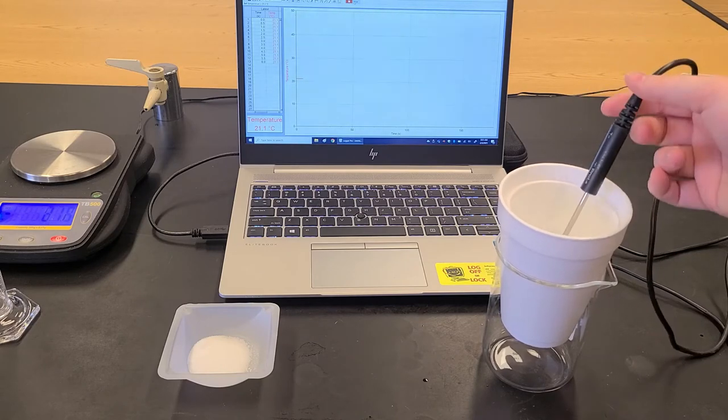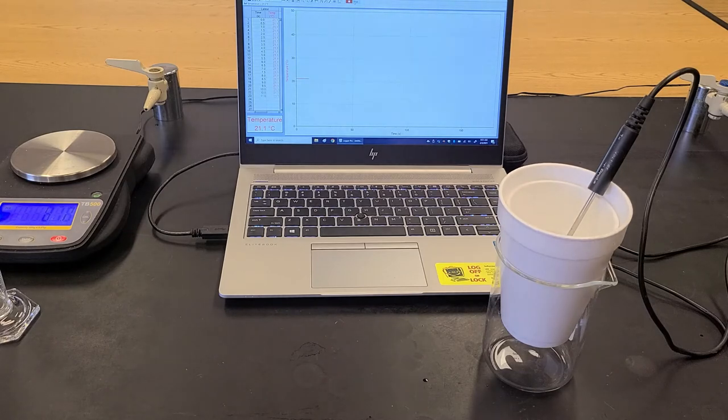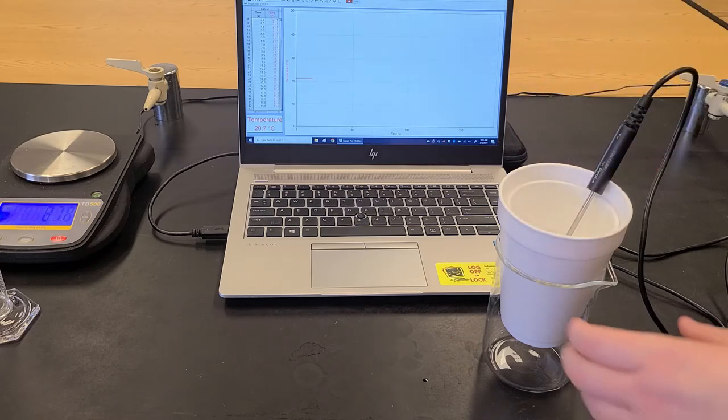So now what I want to do is add this solid. So I'm going to add this in and we want to make sure that it all dissolves. So we're going to stir just to make sure all of that solid dissolves in that water.